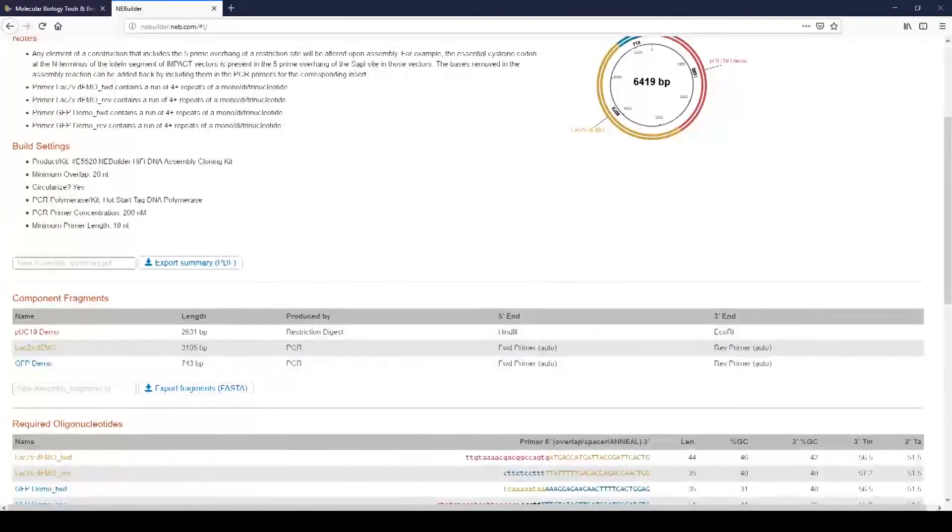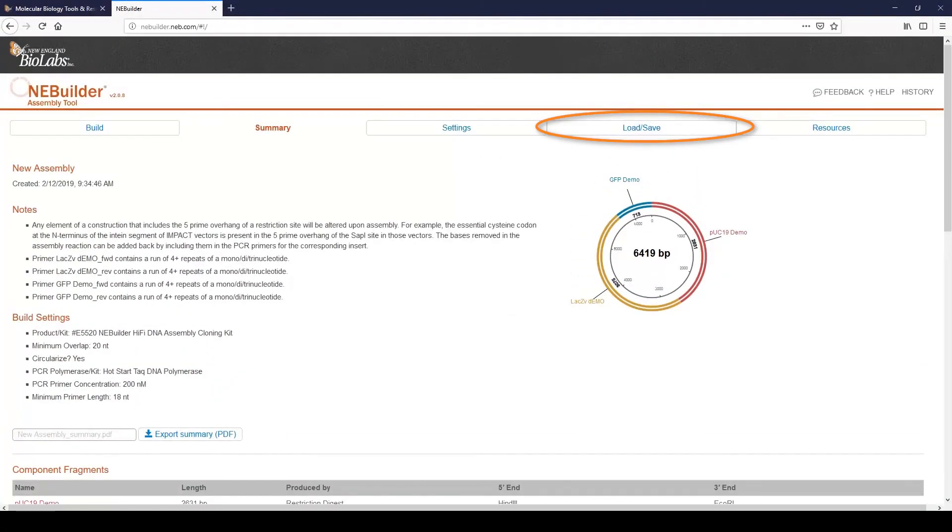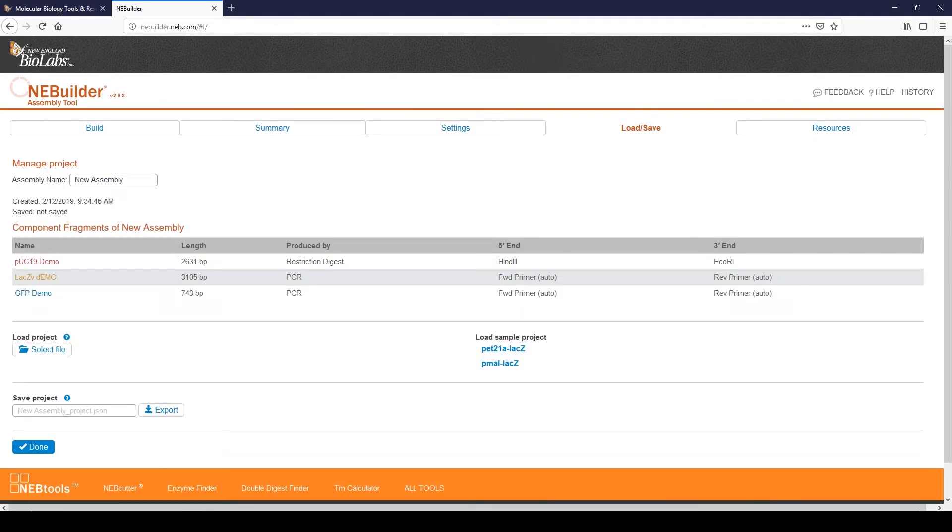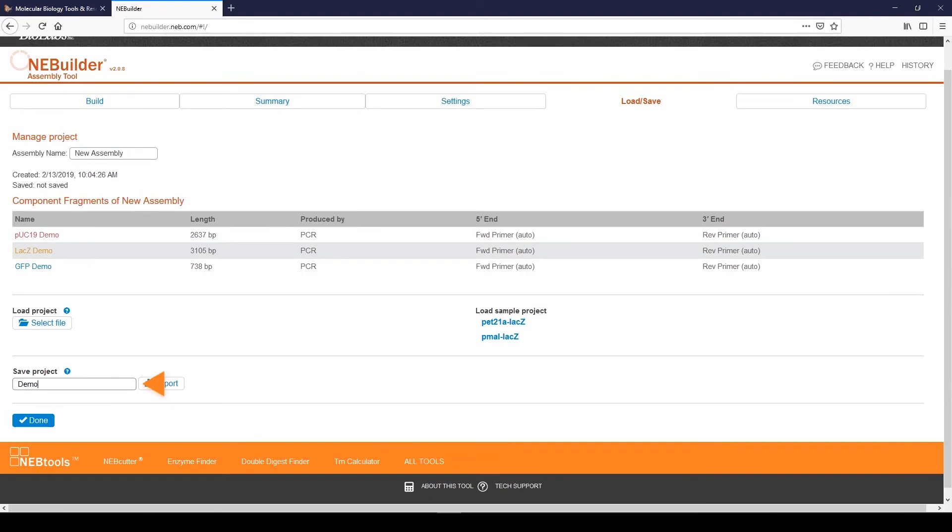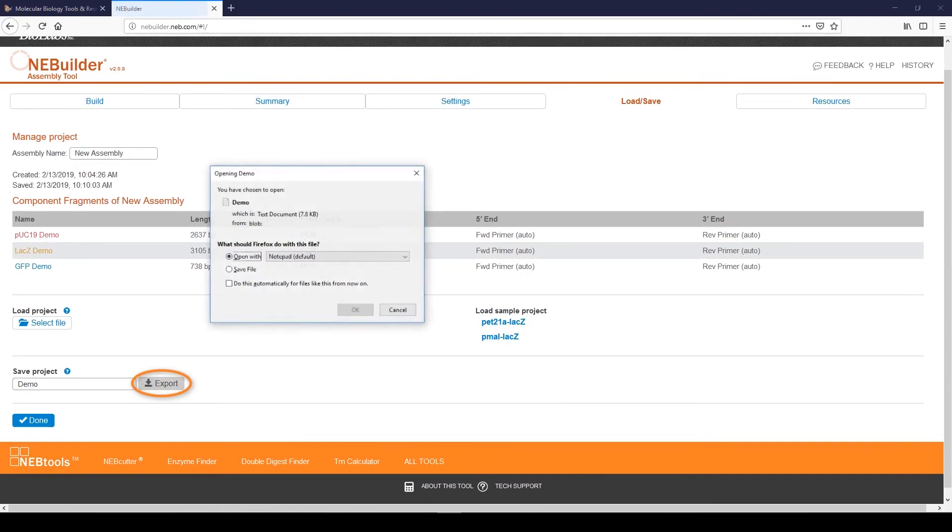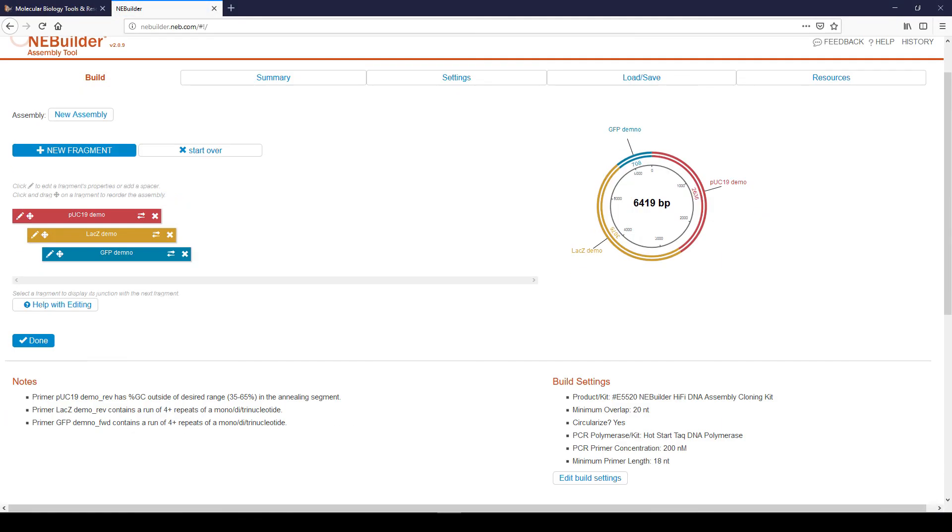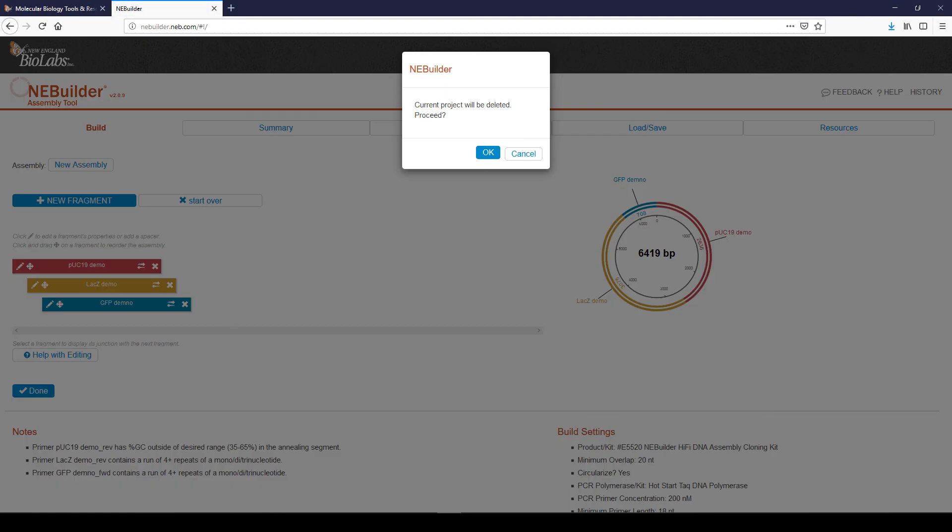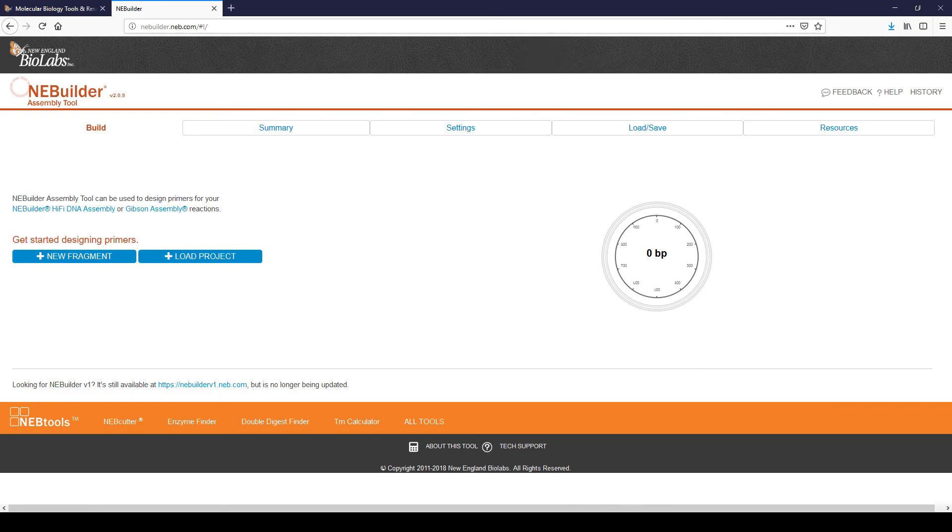Use the Load Save tab to save your assembly. Enter the name of the assembly in the Save Project field and export the file to your computer. To start a new assembly, click Build and then Start Over. Click OK to delete the existing project, and then you can start your next assembly.